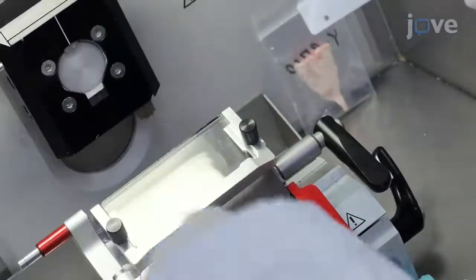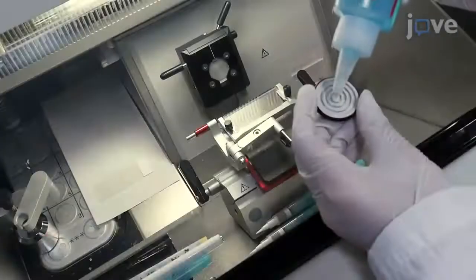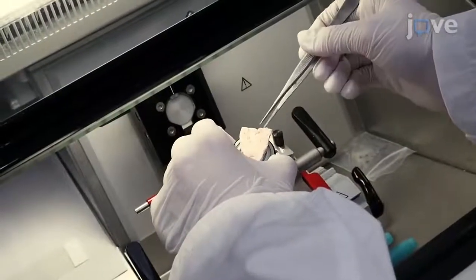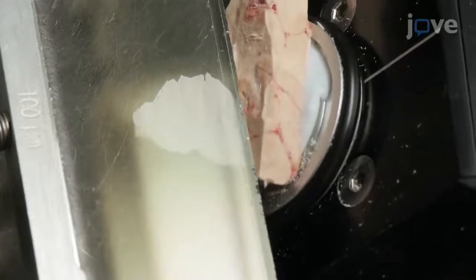Attach a new disposable blade to the cryostat for every experiment. Always try to use a clean part of the blade. Put the frozen autopsy brains on the stage along with a small amount of optimal cutting temperature compound. For IMS and immunohistochemistry, cut 5 to 6 sections from each tissue sample.